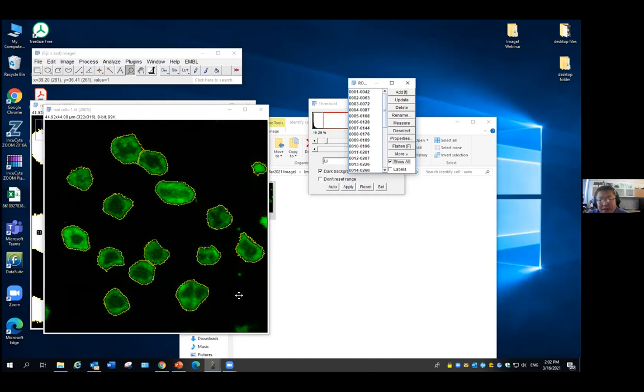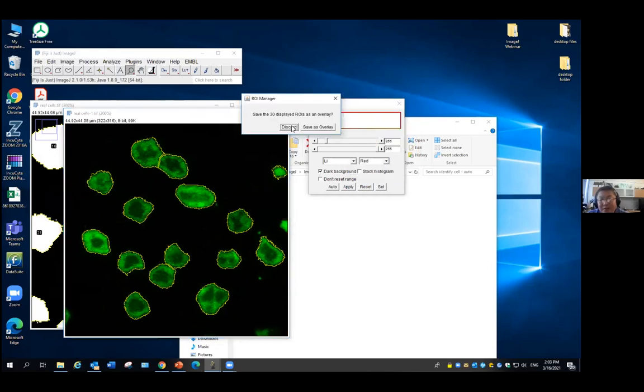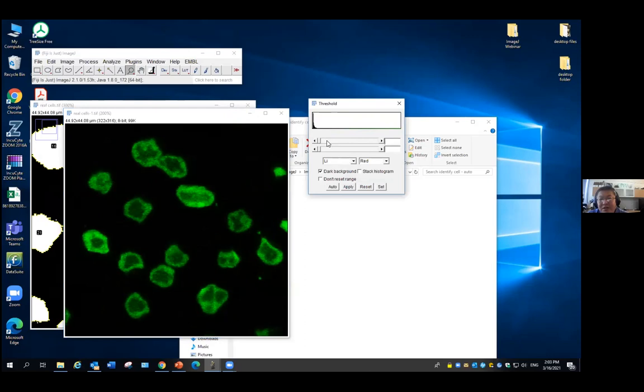We're about to end. So for next Monday, in beginner 3 that we're talking about here, all the images we get are actually pretty good ones. Once I get the image, I can directly use thresholding to achieve a nice mask image. But in reality, you probably cannot directly do that with your image.